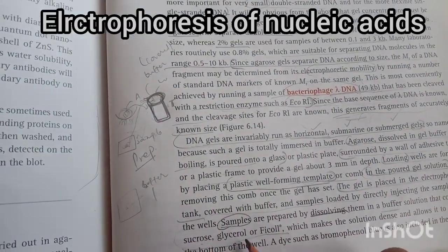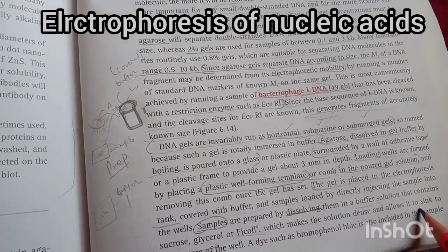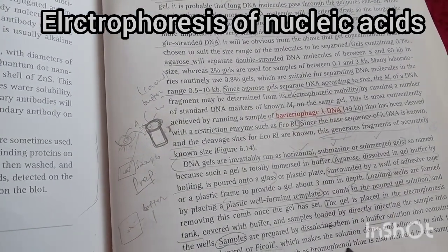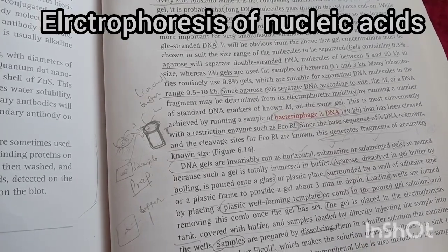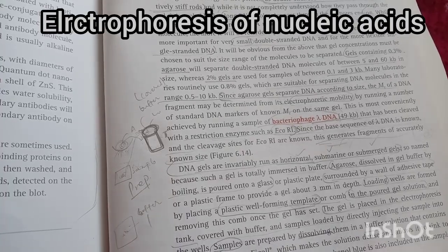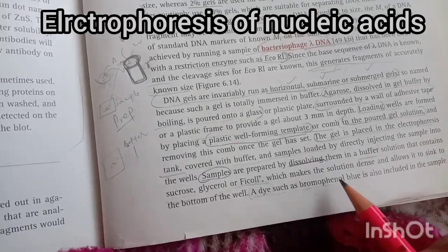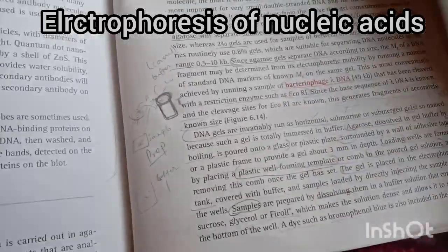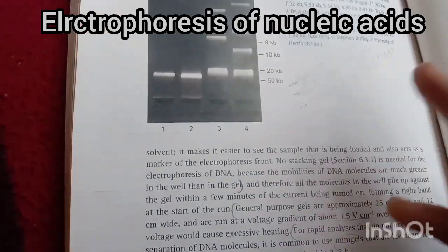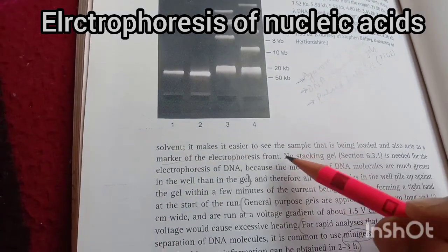Why do we use sucrose, glycerol and ficoll? Because these make the sample solution dense and allow it to sink to the bottom, okay? We can also use dyes such as bromophenol blue, which is an anionic dye that acts with basic dyes mostly, and this gives the blue color, okay? We also study this in histology and histochemistry. So we use the dye bromophenol blue in the sample, so it is easier to see the sample being loaded, and it also acts as a marker of the electrophoresis front.